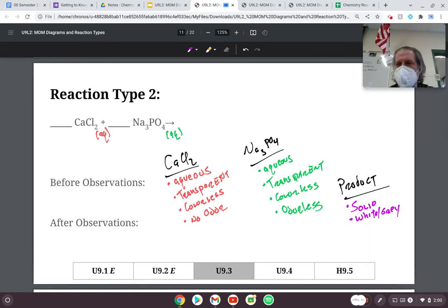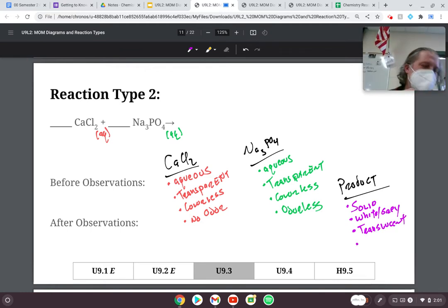In terms of attempting to describe the texture, if I hold this up to the light, it does appear to let a little bit of light through. So we might say that it's translucent. And it had been described as slime-like earlier this morning. Okay.